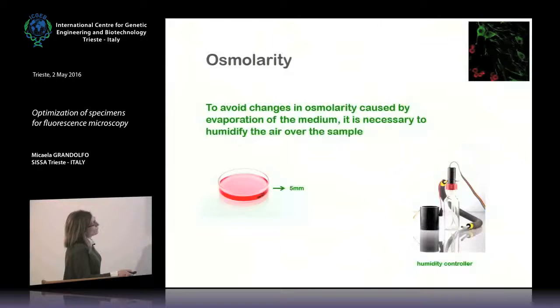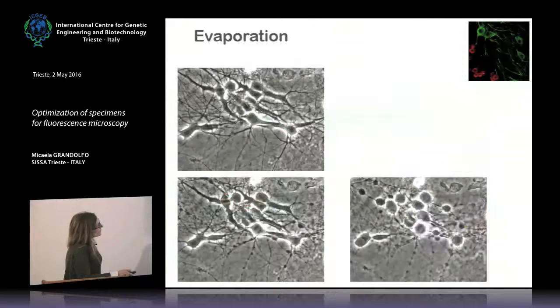So to avoid this problem, you have to work with sealed chambers, or if you're working with large boxes, you need to humidify the air over the sample.